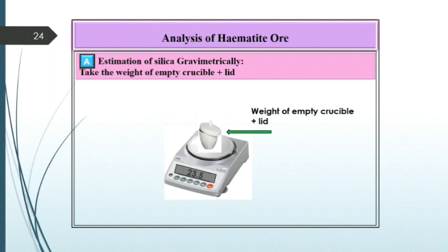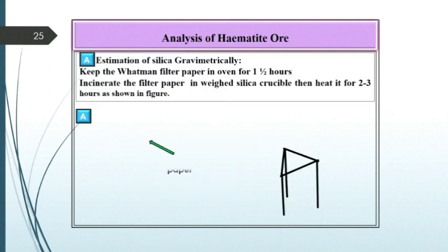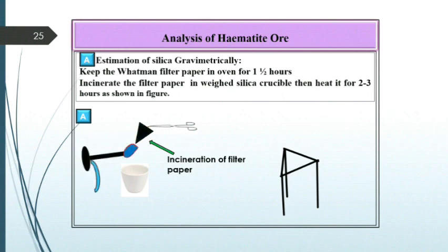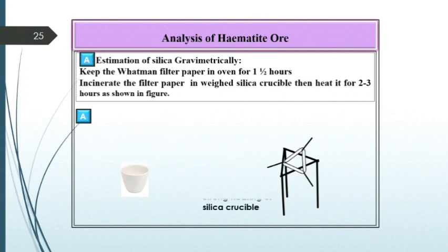For the incineration process, take the weighed silica crucible and fold the Whatman number 41 filter paper as shown in the video. Ignite it till it becomes white, then transfer all this filter paper in the crucible. Then heat this crucible strongly on a blue flame for two to three hours.